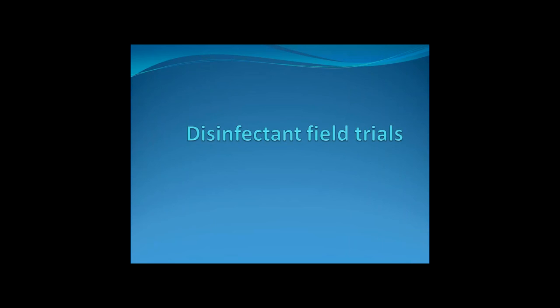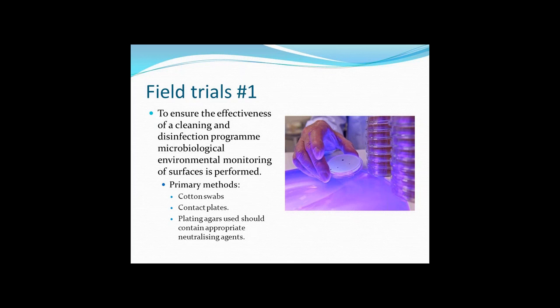So the microbial flora feeds into the field trial. Knowing what we may or may not find helps us to construct the results of the field trial. And the field trial is important because it's the ultimate verification of how well a disinfectant works or does not. Now, unfortunately, there is currently no regulatory or European disinfectant standard for this. But essentially it means establishing our frequencies and using environmental monitoring methods to assess what happens after disinfection. So here we can use cotton swabs and contact plates, ensuring that the agars that we use for contact plates and for plating out swabs contain an appropriate neutralizer against the disinfectant. Otherwise, the risk is that we will get false negatives. So that's a key recovery factor.